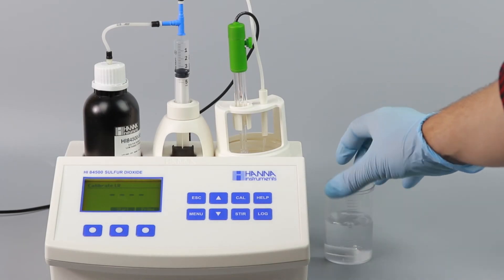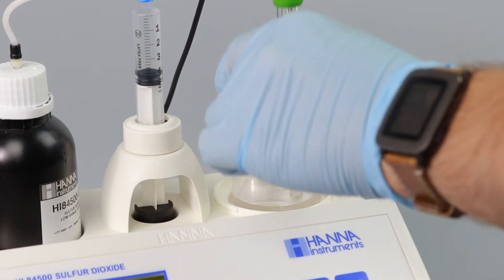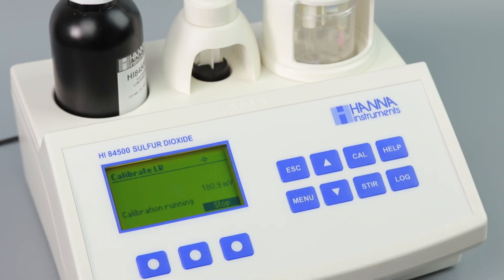Now, add a stir bar to your prepared sample and place it in the beaker holder. Ensure that the electrode and dosing tip are fully submerged. Now press Continue. The calibration will proceed automatically.